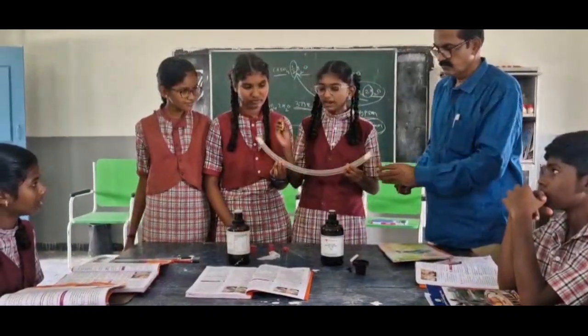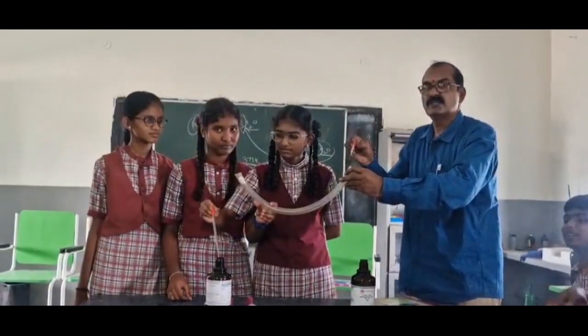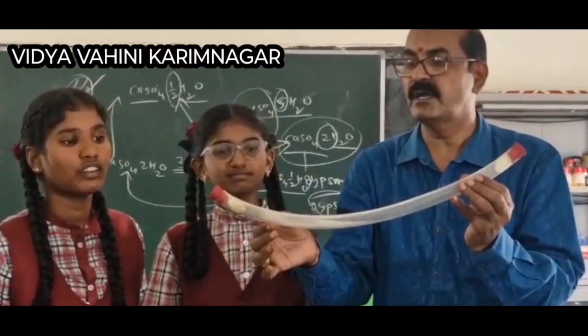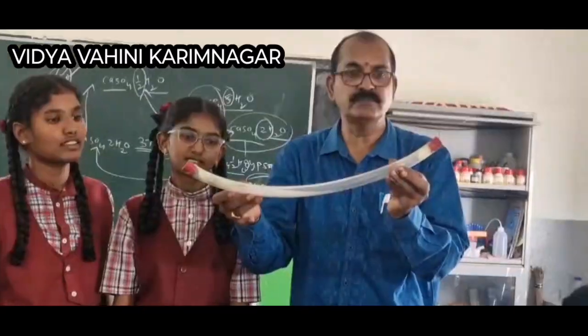Plastic tube. I am taking hydrochloric acid, 1 drop into the cotton wool. It is called ammonium chloride. What is the ring? Ammonium chloride is formed near to the HCl.